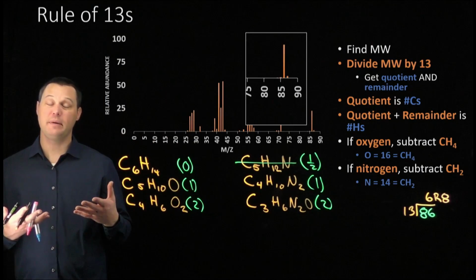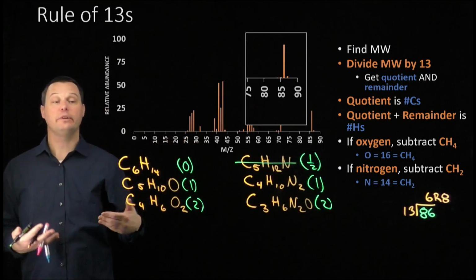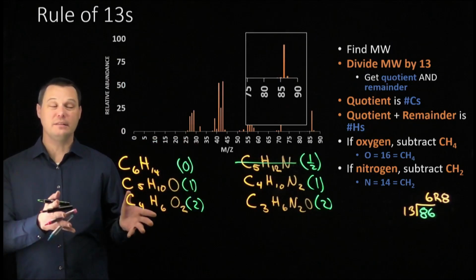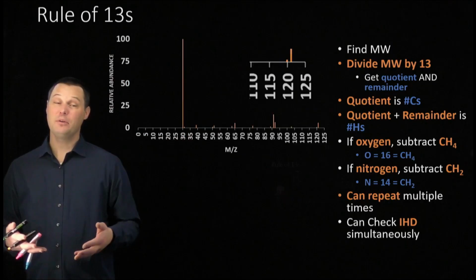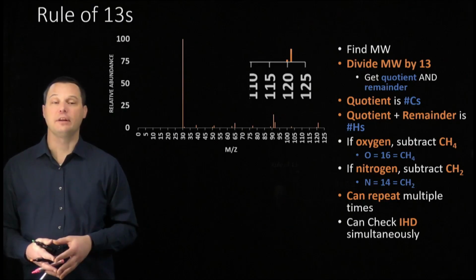When I teach my students mass spec, I like to tell them mass spec doesn't tell us a whole lot, it just gives us context within which we can analyze the rest of the spectra. And this neat little trick certainly fits in that category. Let me run through another worked example fairly quickly without much commentary so you can see it in action again.